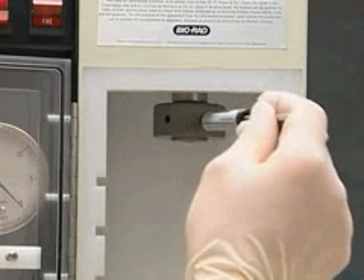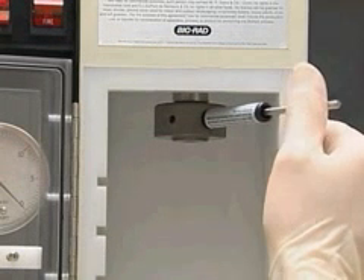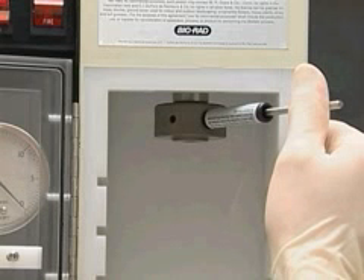Tighten the retaining cap with the torque wrench. To use the torque wrench, insert the short end of the metal rod into an accessible hole in the retaining cap. Push the long end of the rod to the right until the stainless steel rod touches the inner surface of the black tube.